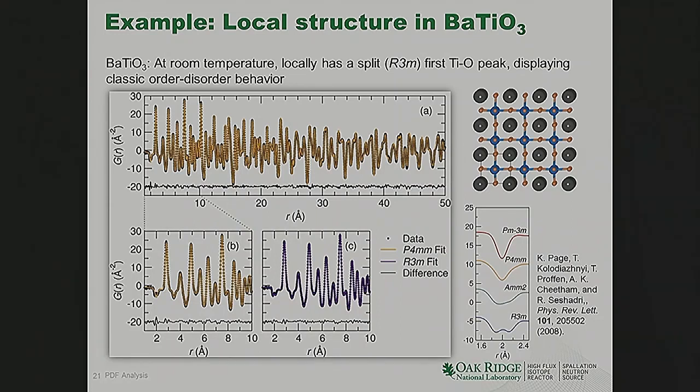So it's absolutely the cartoon that I showed you before. This near neighbor pair-pair correlation is always fit, no matter the temperature, with that ground state rhombohedral structure. And at different crystallographic transitions, there's just different directions that are averaged to give you a net polarization vector. Okay.